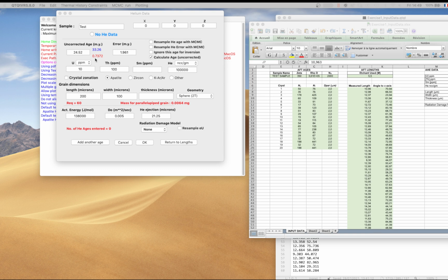So this value, the FT factor, is always less than 1, so we don't really expect a grain size of less than 1. So if we put in the FT value here, you see a little box will come up here where I've got R equivalent equals 60. On top of that, to say, do you want to convert this to equivalent radius? You check that box. You'll end up with the equivalent radius of 60 or very, very close to 60.